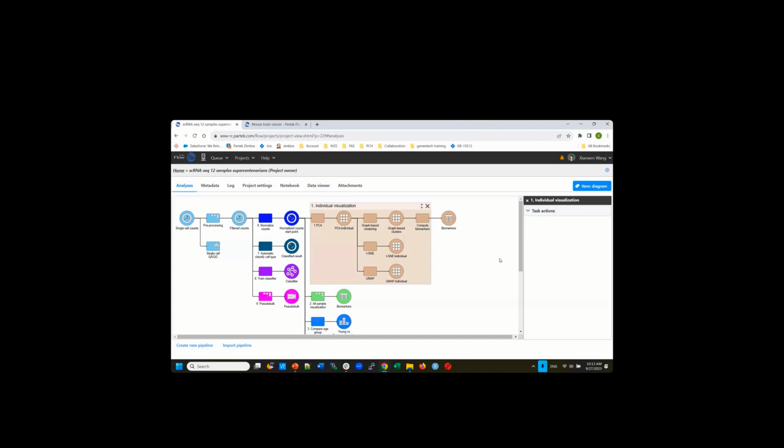I still recommend you analyze your data the first iteration just pretending they don't have batch effect, until you really see a clear batch effect, where batch variation is much bigger than your biology variation. And then you come back and remove the batch.